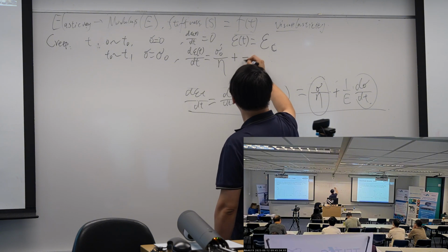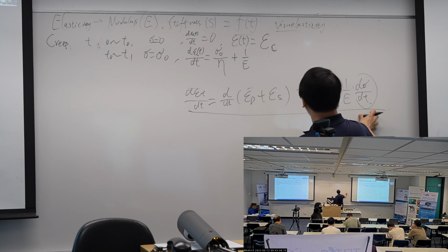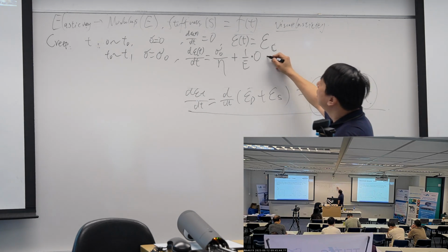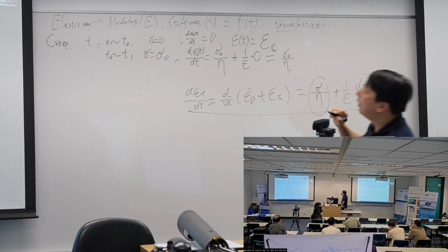I hold the force, so this one should be 0, and the total is just sigma 0 divided by eta.